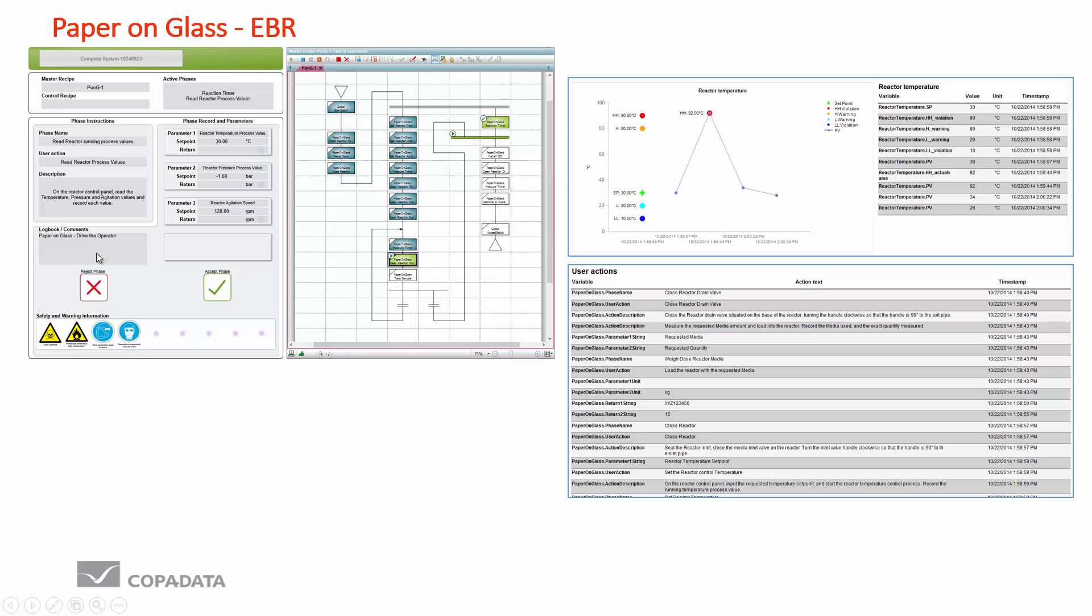Because we record information automatically into a historian, as soon as the last pill leaves the production line we can create a batch record. We collect all the information automatically during the batch production and instantly we can generate a production report which gives a user audit trail about all the events which have happened during that batch.